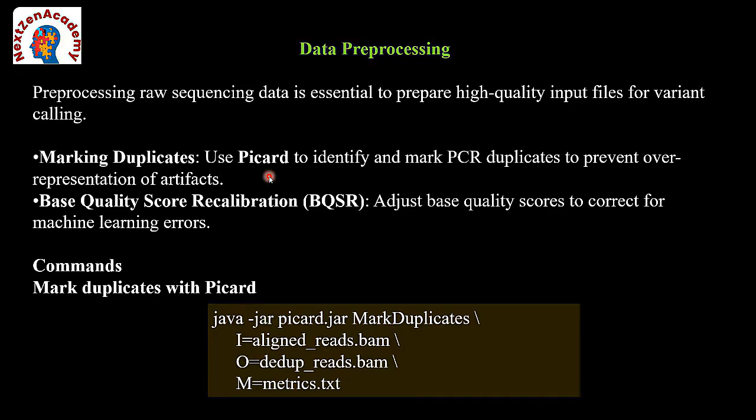So you need to download it. Once that is downloaded, you can run a command like run_deepvariant with the model type. What type of model? We have worked with sequencing here.